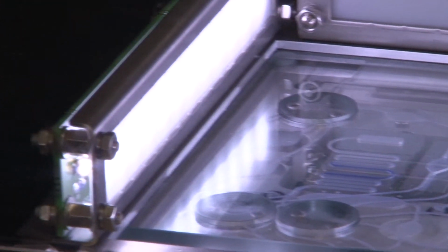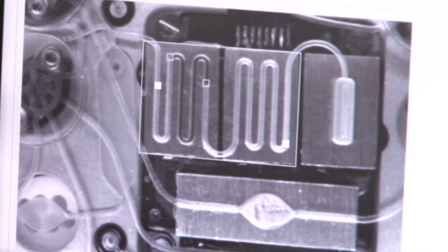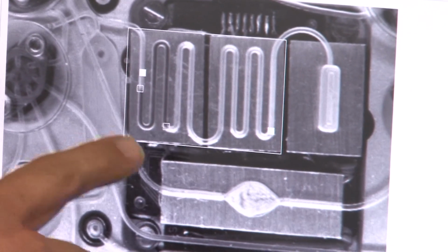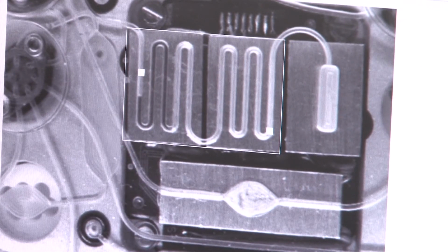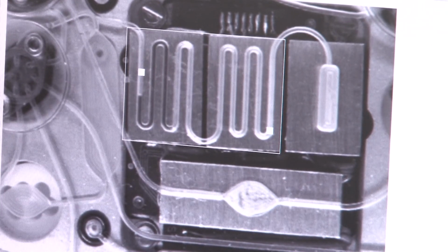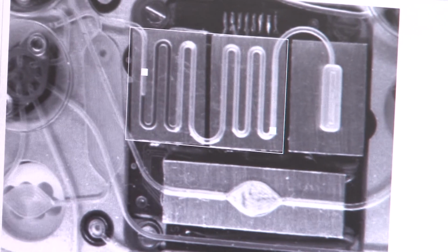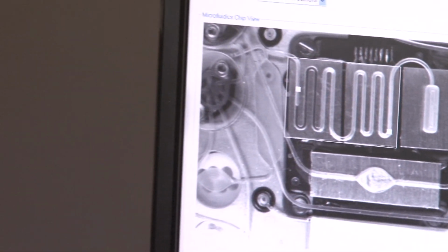What you can see here is an oscillating PCR. This is a 2 temperature zones PCR, which is basically moving the fluids back and forth, thus achieving the temperature changes that are necessary and in many different cycles, and in as many cycles as you want.